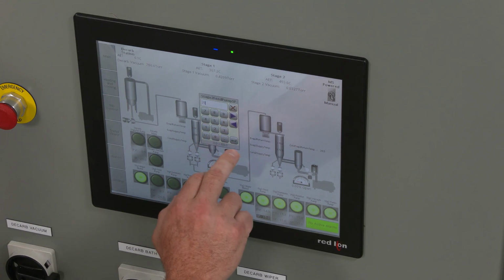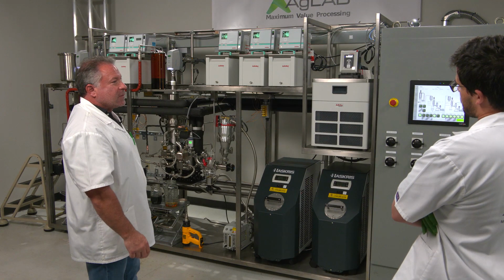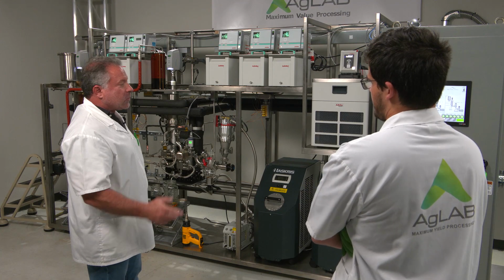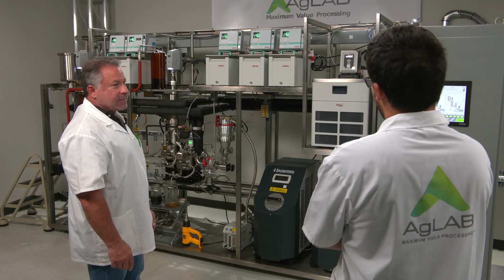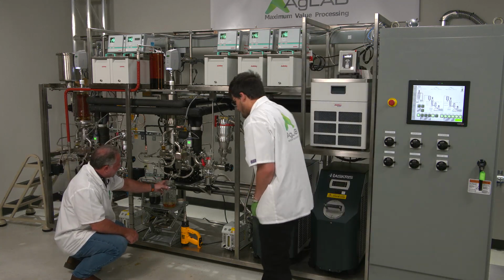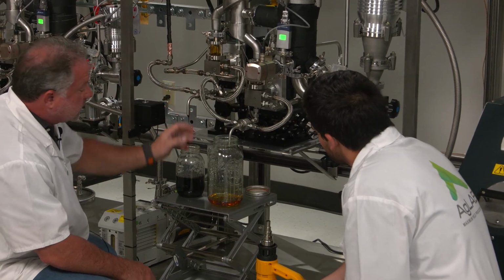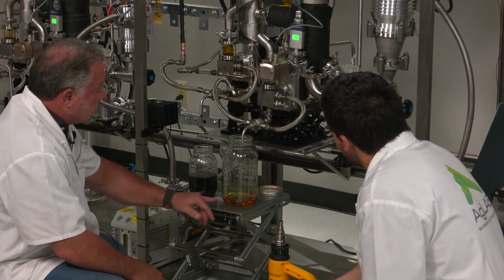So the material is going to be exposed for a lesser amount of time, which I feel like it's hot enough that it's not going to hurt the condensation of CBD. So we're doing this to protect the potency of our distillate. Correct. And you can take a look at this here. We have really good color distillate, which means we're not condensing any other analytes that we don't want in the system. We should have really high CBD in here, I would say 88 to 90.